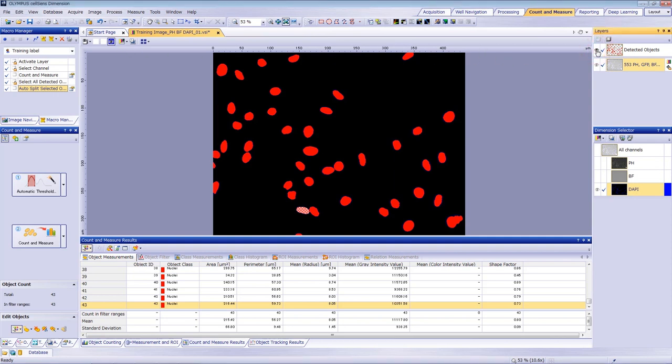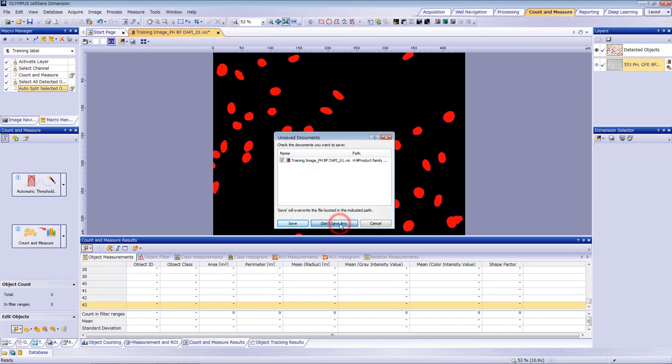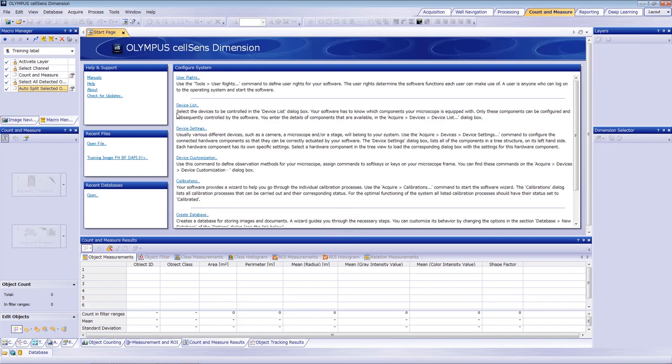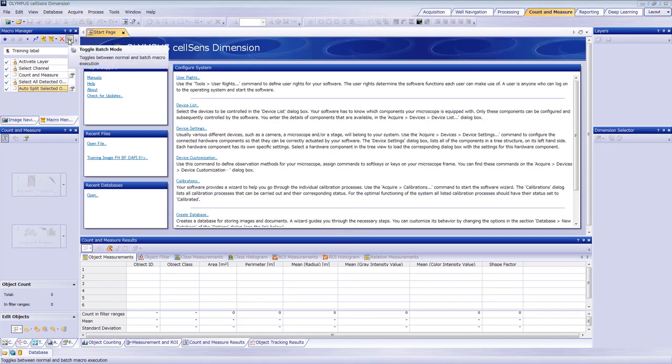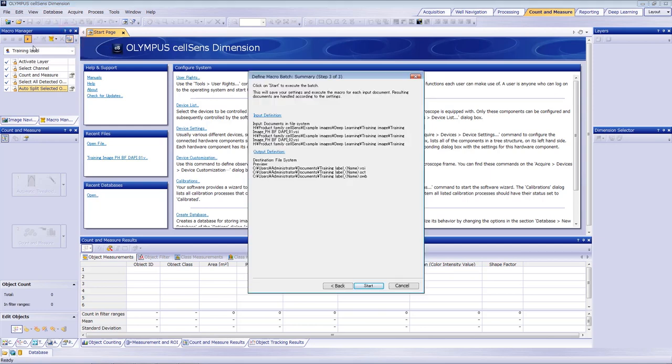Now, let's apply the macro we recorded to multiple images. Close the image you have open. Activate Toggle Batch Mode and then click Run Macro. We're going to use images in the Installer Guide for this example.